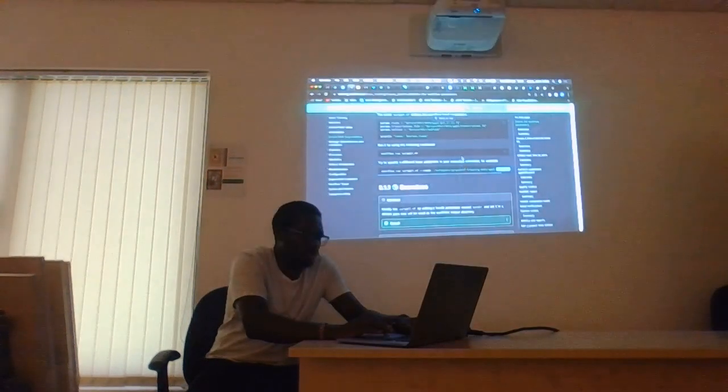For the rest, I think I'll just copy here. Something of that sort.